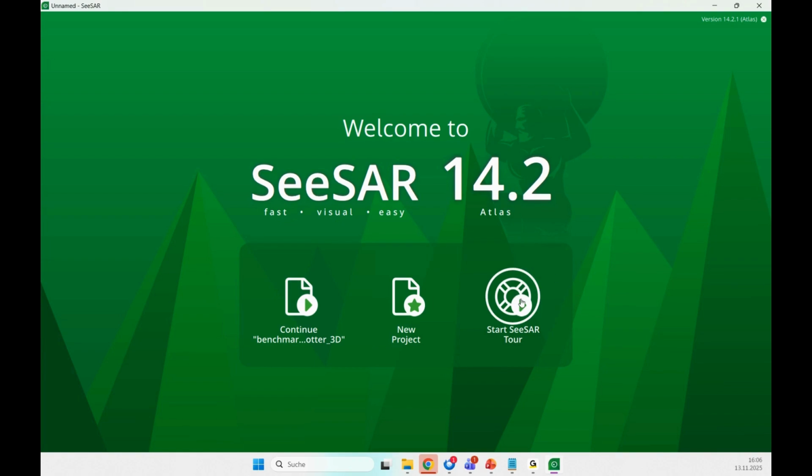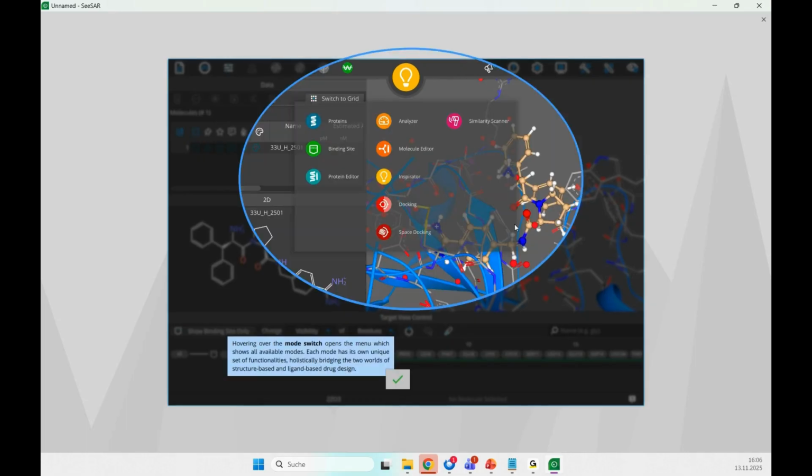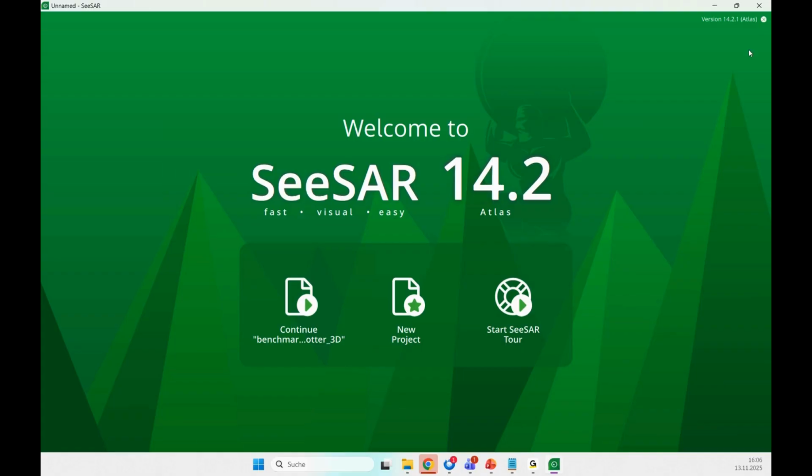If you need a little bit of introduction to the functionalities of SeeSAR and how to do the first steps, there's a small SeeSAR tour which you can click here, and then everything will be nicely explained to you, which you can browse through one by one, explaining what you can achieve and how you can achieve things. And if you don't want to continue this, you can just close the window here. But most importantly for us is obviously starting a new project.